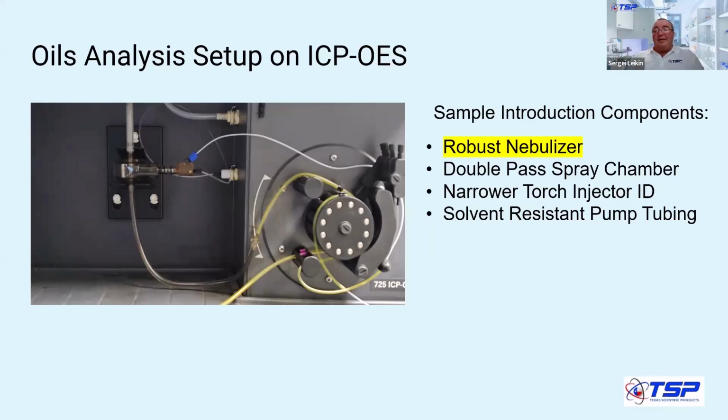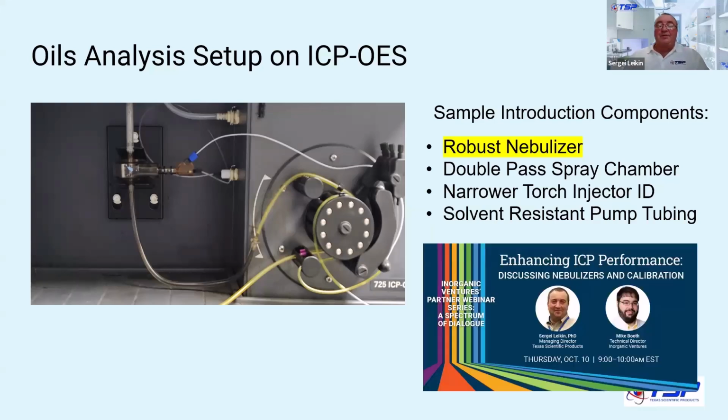And actually, the ASTM method for running oil specifically calls for a Babington-type nebulizer that can handle particulates and things like that.